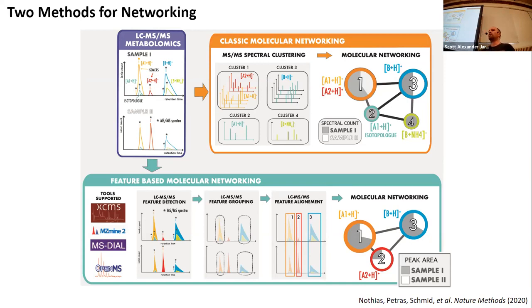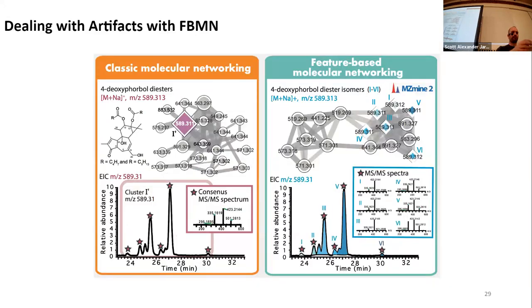I quickly run some classic molecular networks, because I'm not losing MS2 spectra by doing this pairing, right? I'm really considering all the data that is there. So I think there are good reasons to use both approaches. Obviously, for the workshop and this advanced data analysis we can perform with you, I think feature-based molecular networking is the way, but be aware that there's also this alternative.